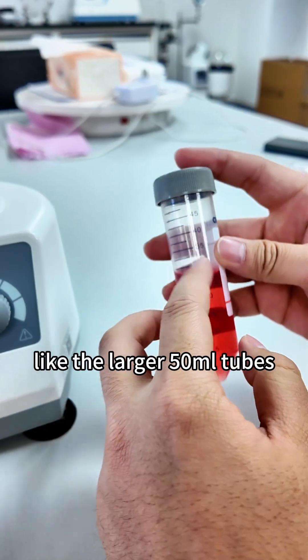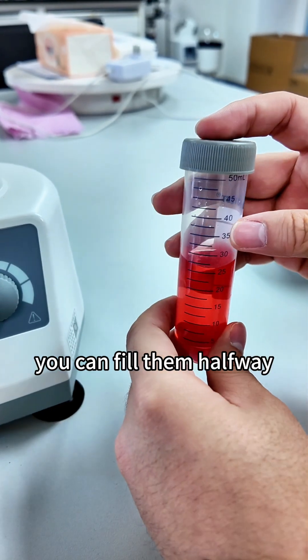For single-tube vortex, like the larger 50ml tubes, you can fill them halfway, and that should be enough.